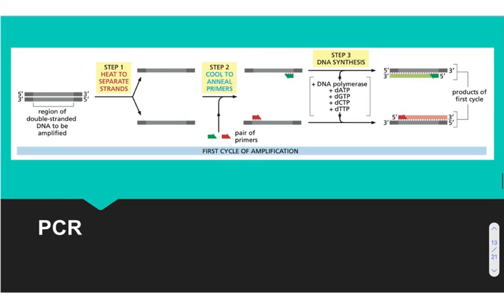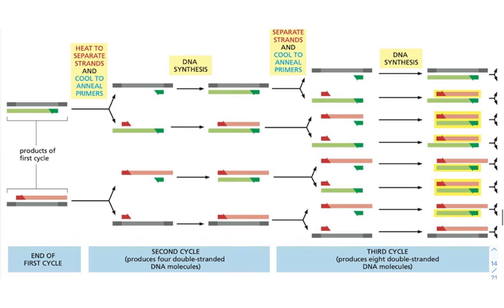And then we do this many times over again, and we get many copies of our DNA that we can use in some experiment. For example, we can do something called transformation, where we put the DNA via various chemical treatments into bacterial cells. So here's another figure of PCR.